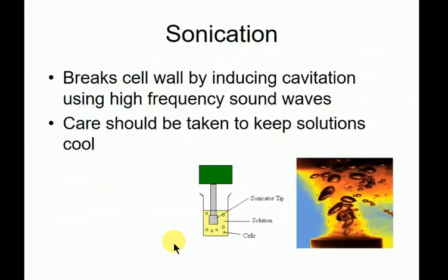Beautiful. Right, sonication. Sonication is good in that it is cheap and easy, and it's probably the thing you have greatest access to in any biochemistry department. So you go in with a set of ear protectors on.